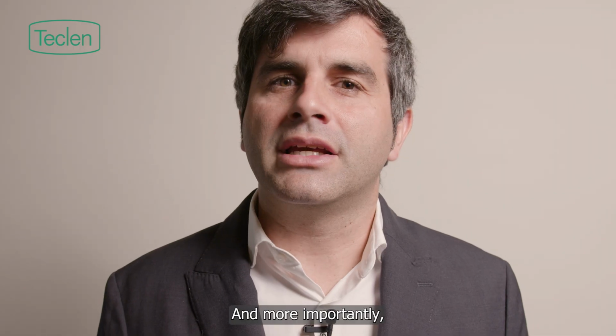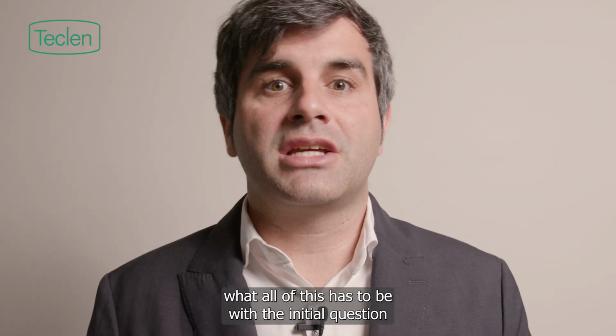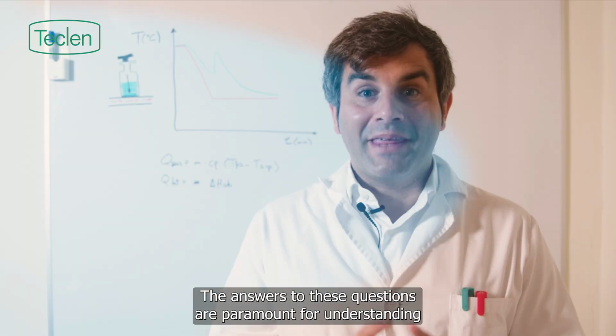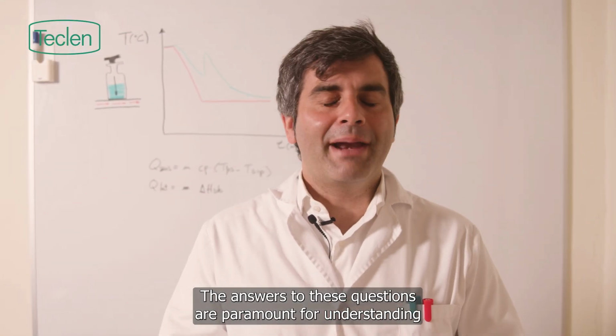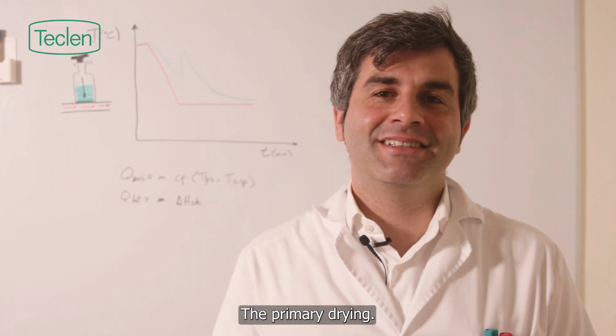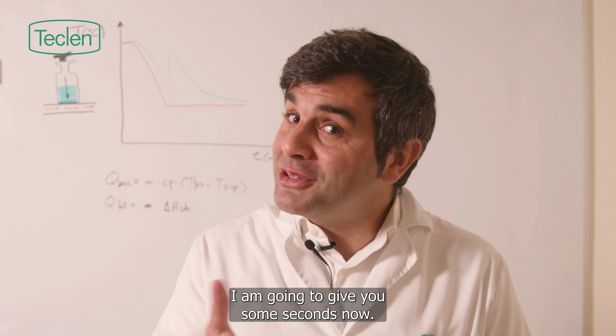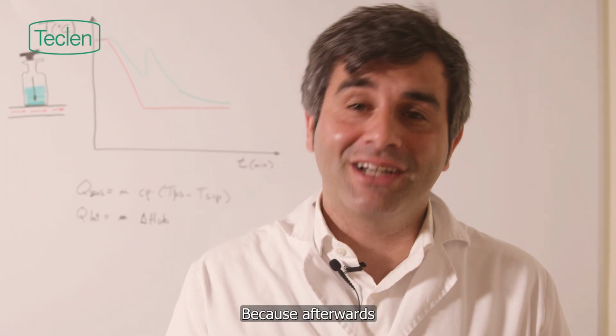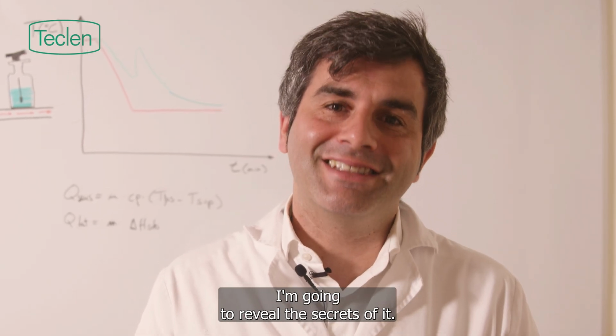And more importantly, what does all of this have to do with the initial question: can we rely on water properties for freeze drying? The answers to these questions are paramount for understanding the main step in freeze drying, the primary drying. I am going to give you some seconds now, you can pause the video, because afterwards I'm going to reveal the secrets of it.